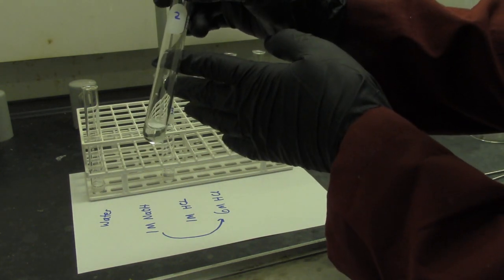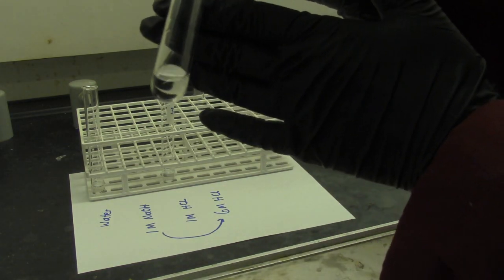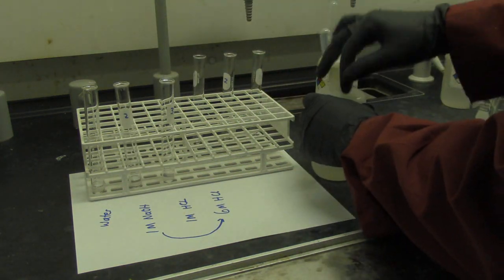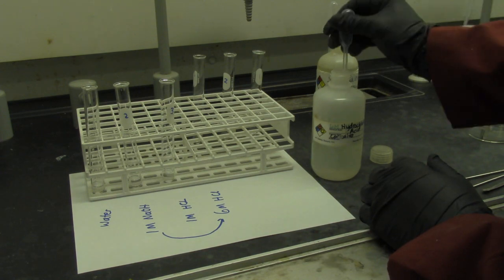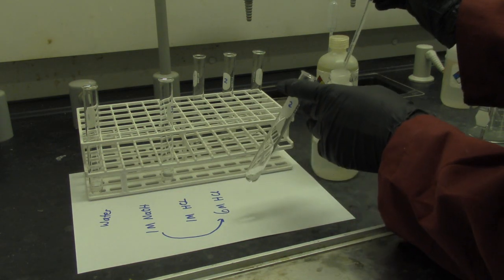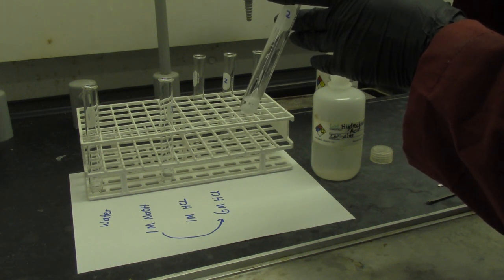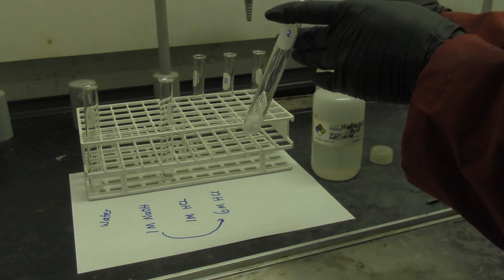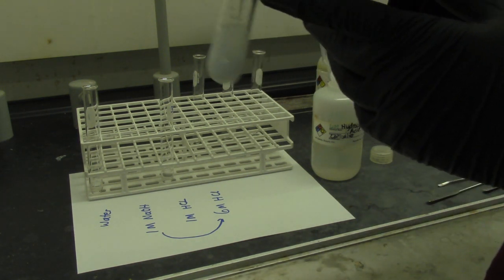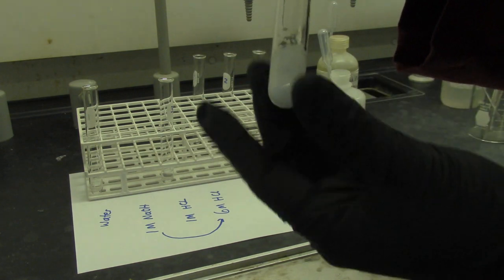So this is the second test tube, benzoic acid with 1 molar sodium hydroxide. Taking the second test tube, I will then add a few drops of 6 molar hydrochloric acid. Take down the observation.